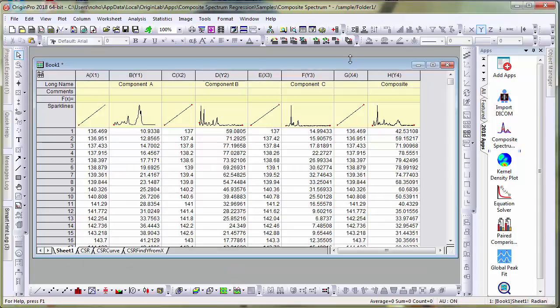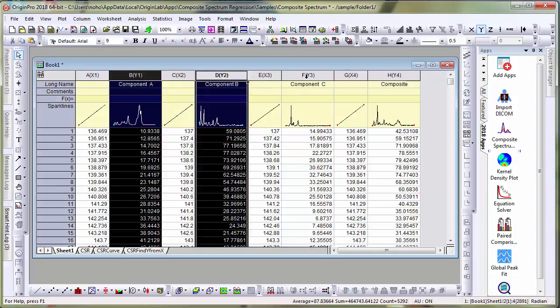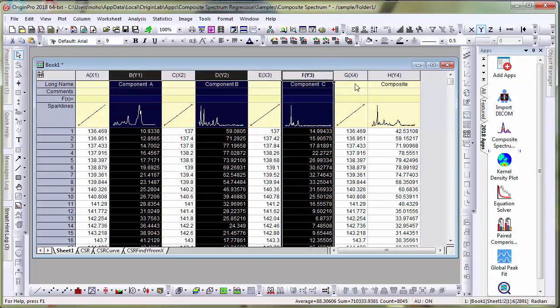I have the project open already. In this project, I have three component spectra, components A, B, and C. The Composite column is supposed to be a linear combination of these spectra.